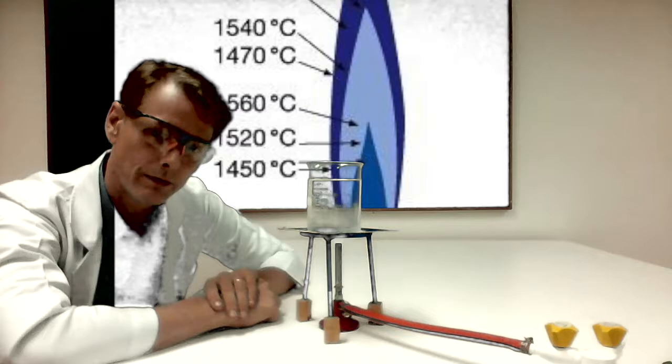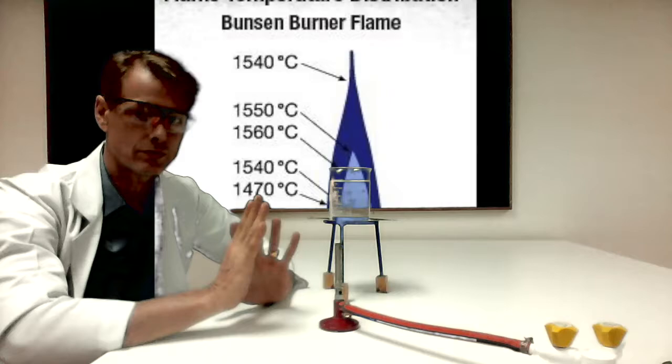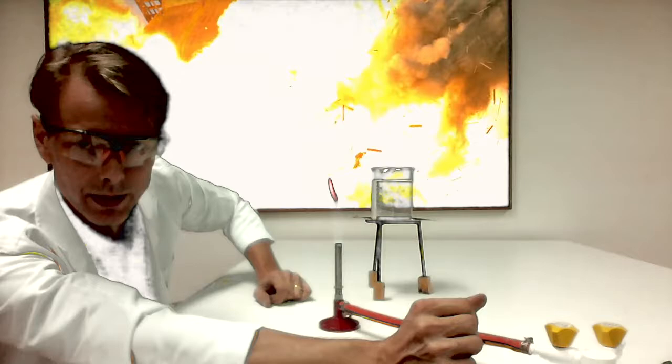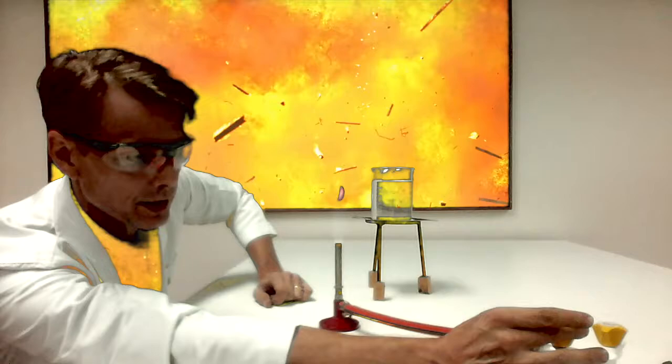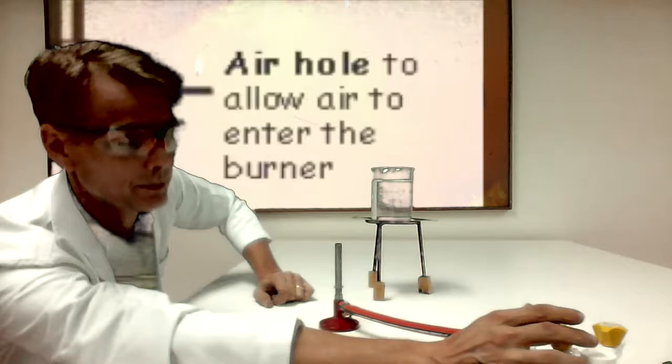Finally, when using a Bunsen burner, the proper way to extinguish it is not to blow it out, though that would suffice. You could blow it out, but you might walk away leaving the gas burning, and then you can make an explosion. Turn it, in our case, clockwise, right next tight. And it extinguishes the flame as it deprives it of the fuel it needs to burn.